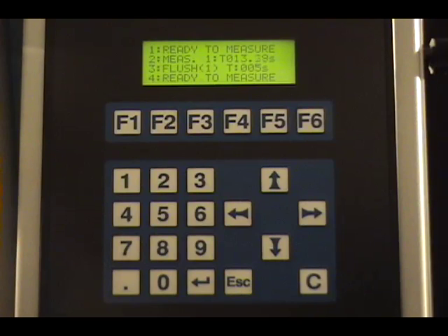When the sample reaches the second optical sensor, the result is printed out. If no printer is attached, the measurement result will be displayed on the LCD screen.